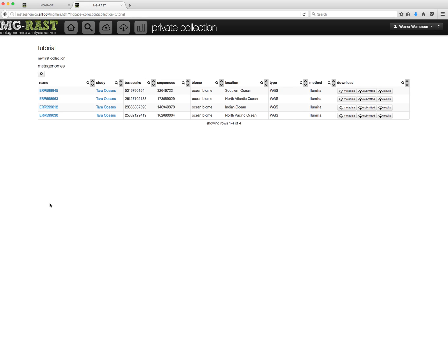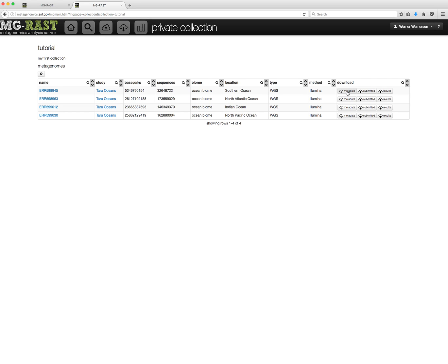The collection page displays a table with information about the datasets, along with links to their overview and study pages, as well as direct download links for metadata, the original upload file, and the annotated results.